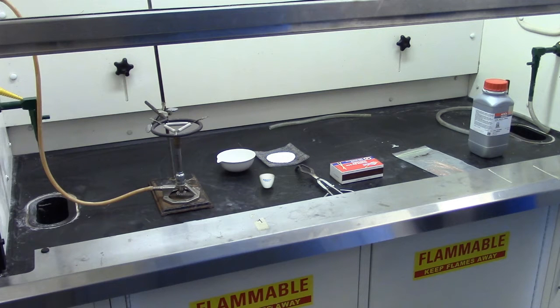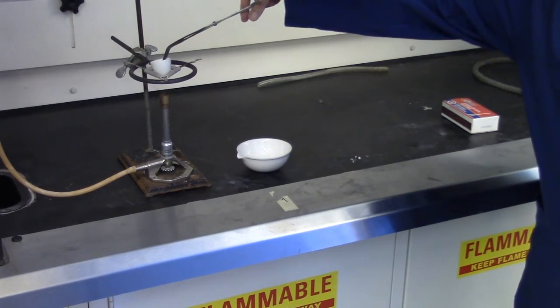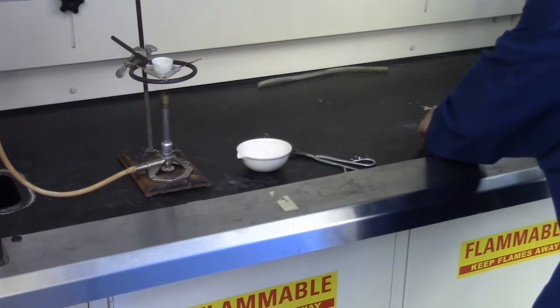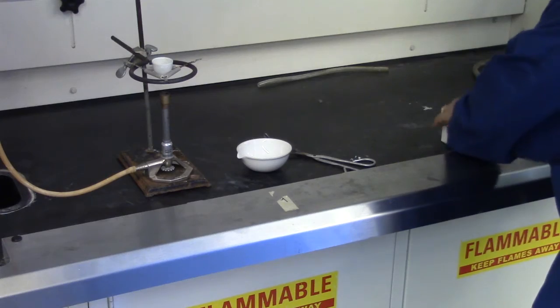Cleaning the crucible. Using a ring stand, iron ring, clay triangle, and Bunsen burner, set it up to clean the crucible. There should be about 5 centimeters from the bottom of the ring to the top of the Bunsen burner. Place the crucible to be cleaned in the clay triangle. Crucible tongs will be needed to remove your crucible after cleaning.